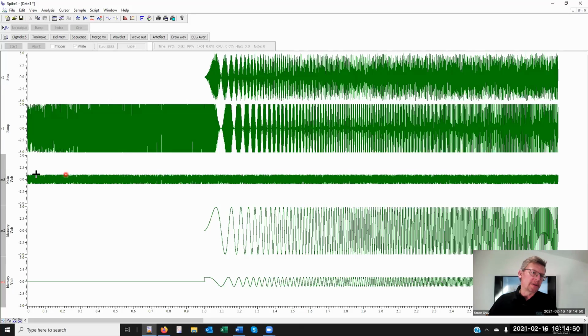I've then asked it to produce random numbers in the range -1 to +1 for the length of this section here. And then I've actually used virtual cursor channels at the top here to combine those memory channels for output. So in this case, we're going to use these for sound, added to play wave, loaded into the 1401 memory and played out during a recording.